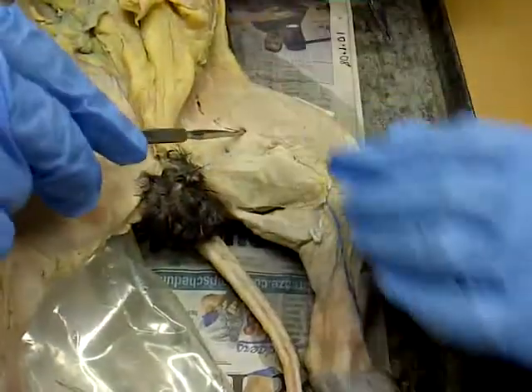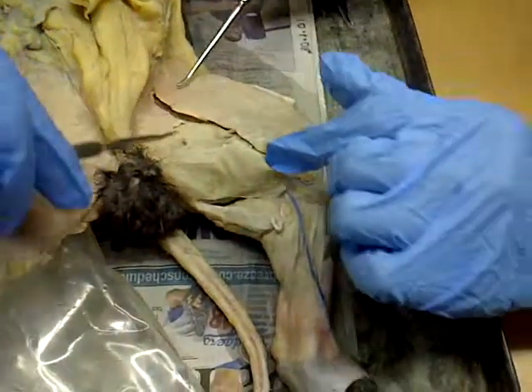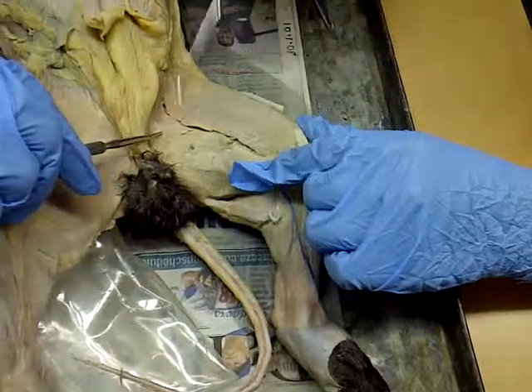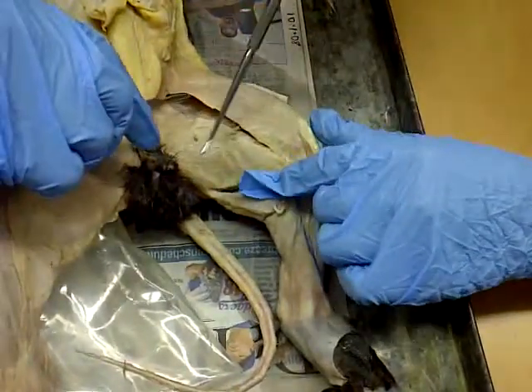All right, from the top. Sorry about that, the rectus femoris is actually on this side. So this flap over here is called the sartorius. This one is called the gracilis. So what's this one called again? Sartorius. This one, gracilis.